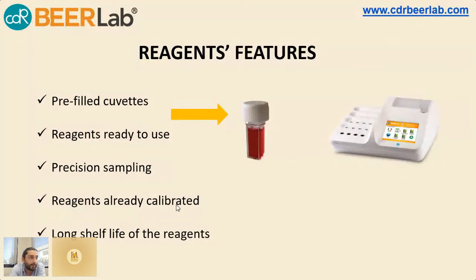The analysis consists of taking the sample, putting the sample into the cuvette, and waiting an incubation time that normally is between 10 seconds and 10 minutes. Okay.